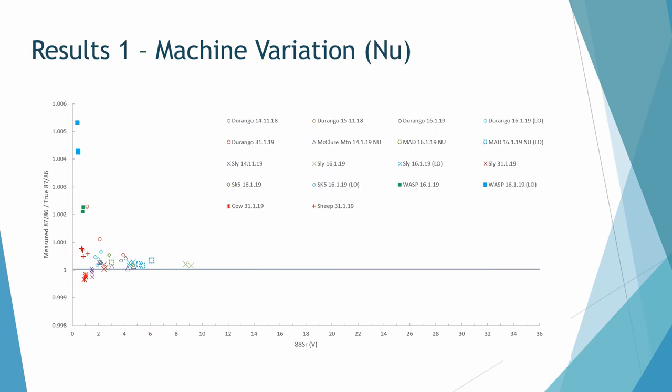In an ideal world, all data would sit along the line of unity, but it doesn't. This graph compares the voltage of Sr-88 — the most abundant strontium isotope — to the accuracy or bias of the ratio, comparing our measured values to TIMS values. Low strontium enamel samples are quite far away from the line, and even higher strontium apatites, which are closer, aren't sitting exactly on the line.